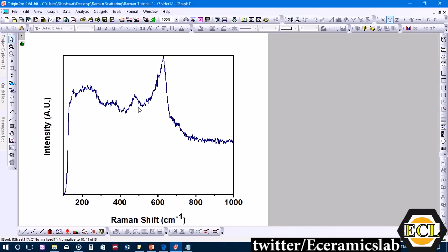In this curve, unlike XRD patterns, there are no sharp peaks — instead there are wider, broader peaks. You can see one broad peak, another broad peak, another one, and we'll try to deconvolute this region to see if there are any peaks present there.